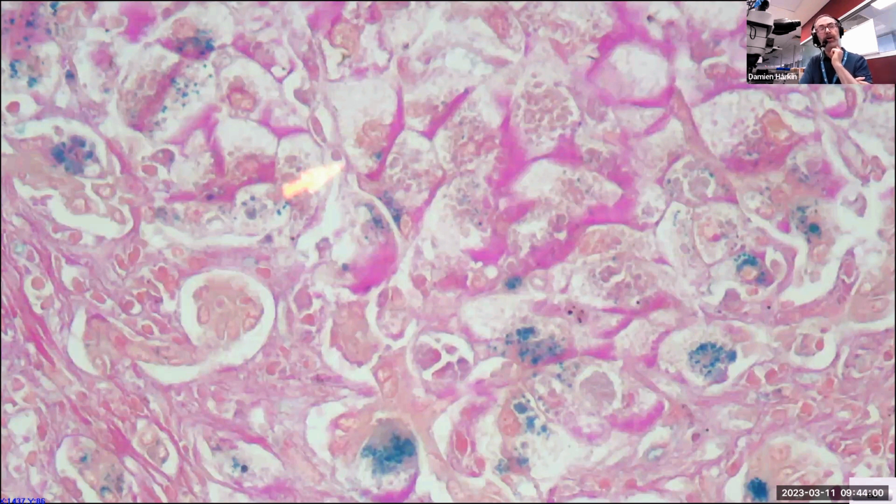If you go in with periodic acid and you're oxidizing the tissue, what effect would that have on the Pearl's Prussian blue that's already there? I would like to think that by virtue of it complexing and forming this insoluble salt, I would hazard a guess and say that it's fairly stable. But it'd be interesting to have a discussion about that with Chris.